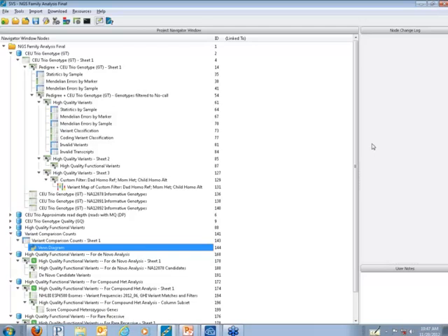If you have any questions, whether it's about sequence data, working with your sequence data, RNA-Seq data, DNA-Seq data, please email support@goldenhelix.com and we can help you on an individual basis, either by pointing you to the place to go for more information or by setting up an individual training session.